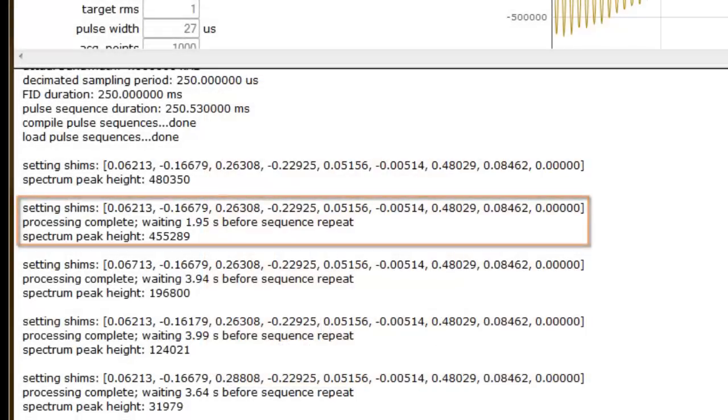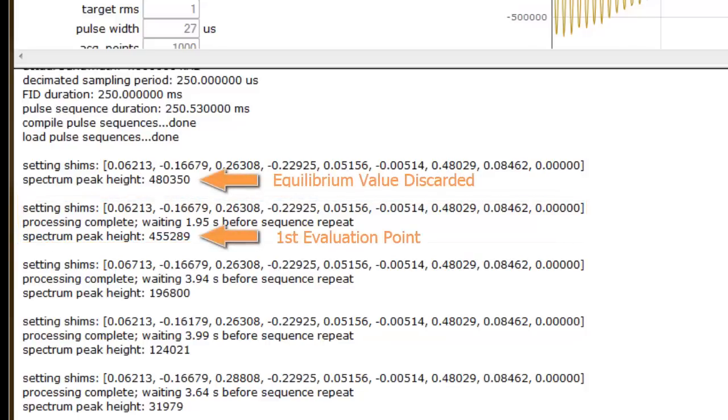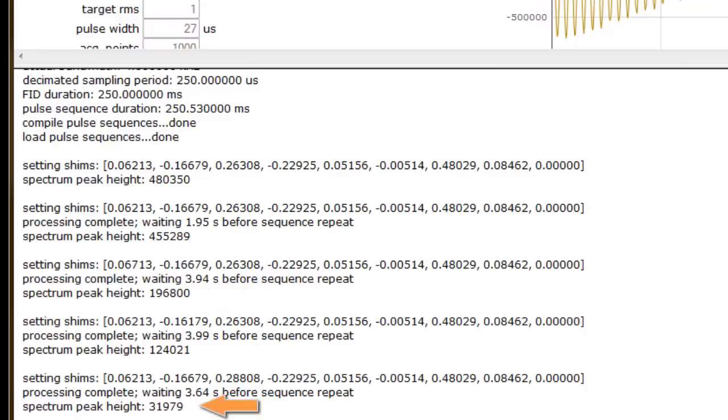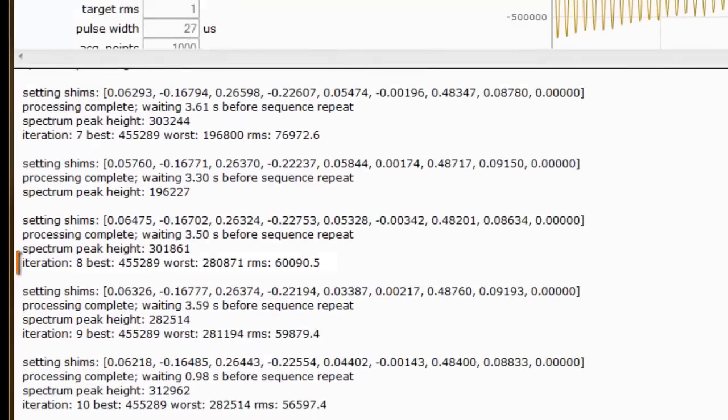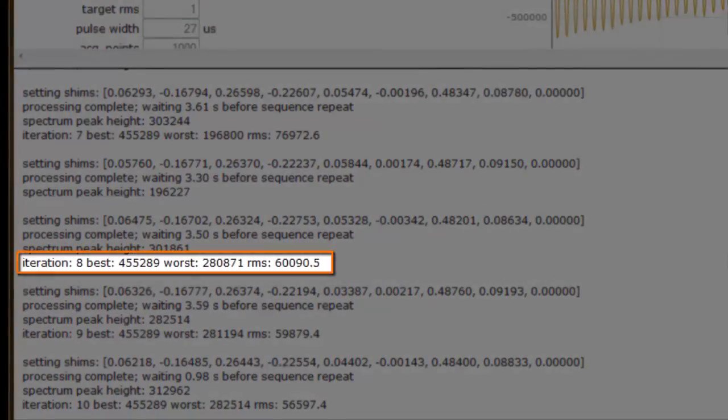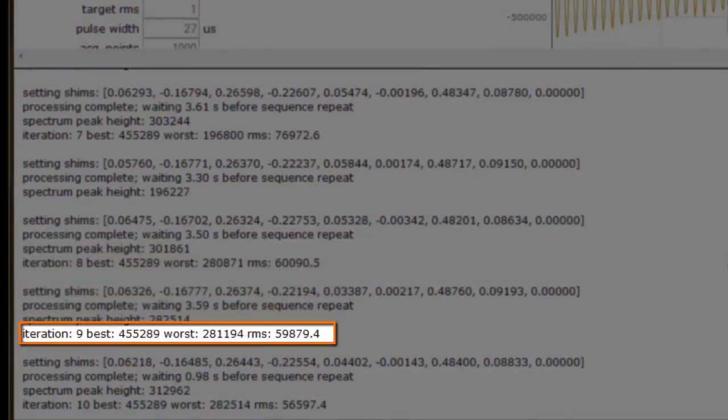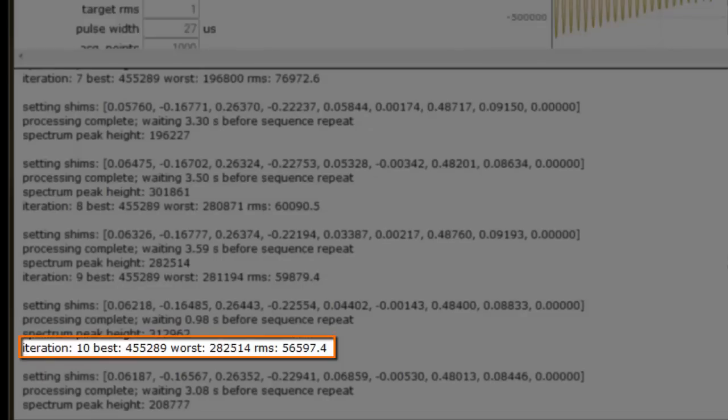The second series of data indicates the beginning of the evaluation phase of the AutoSIM script. This spectrum peak height is our starting point, and it is the value we are trying to improve upon. When an improvement in this value is achieved, the AutoSIM script retains the corresponding coil values, assigns the associated spectrum peak height as the new best value, and continues to explore in that direction. We can keep track of the script's progress by monitoring the best spectrum peak height value, which appears after each iteration.